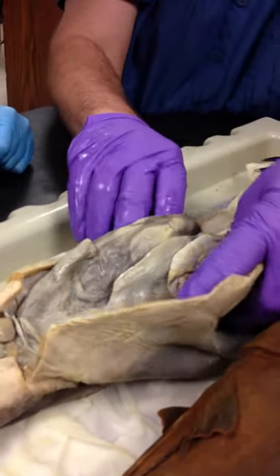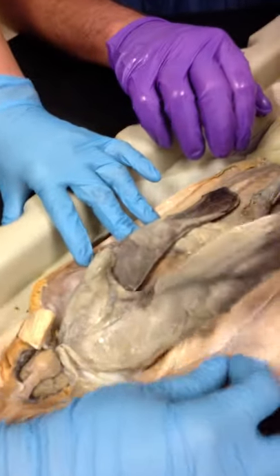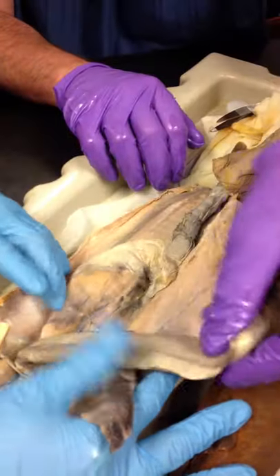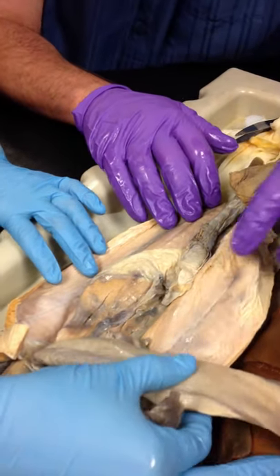Now we're going to open the abdominal cavity. Oh, my gosh. It was magical. The first thing I want to see here is the liver. Here's a piece of liver. Very good. And there's another piece of liver. Giant liver. Why is it so big? I'm not going to tell you. It's a secret. I'm going to tell you in a lecture when we get to it in August.